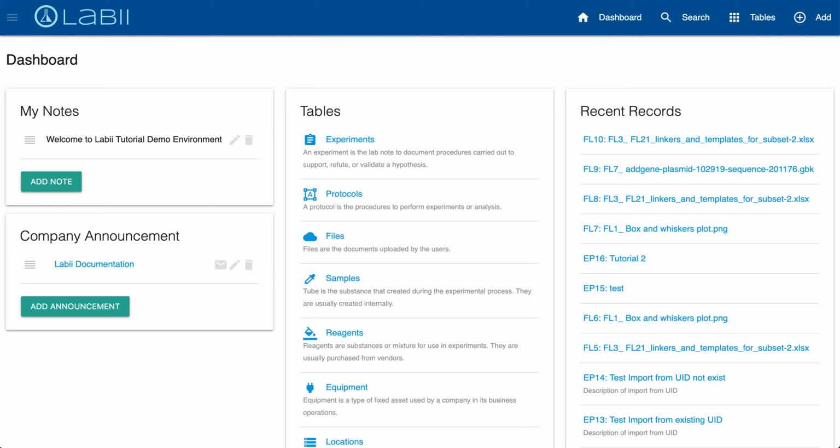For today's video, I'm going to walk you through and explain how to utilize tables within your organization and how to customize the table settings as well. Before I begin, I wanted to mention that only administrators within an organization can use the table settings to customize how they store their data. So please be very careful, as every change that is made will affect the data dramatically, and these changes cannot be restored.